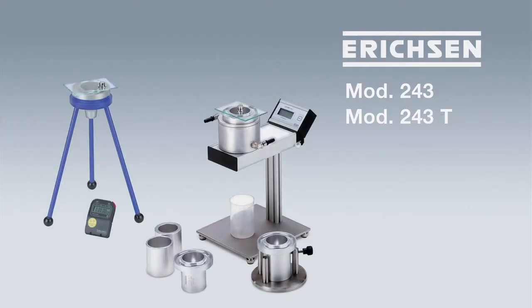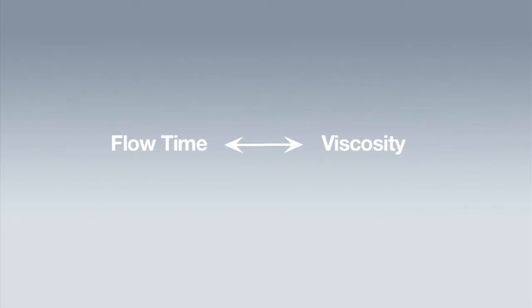For any form of wet paint application, viscosity is of importance. Measuring its flow time with a defined flow cup is an established method of evaluating the rheological characteristic of a liquid coating material.